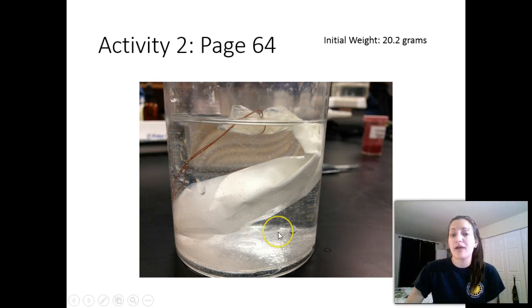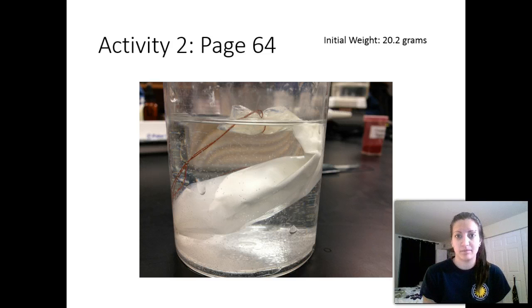In this water, we don't have anything else. This is 100% water, whereas inside the bag, it's less than that. I don't know the exact percentage, but it could be something about 70%. We definitely know it's not 100% though.